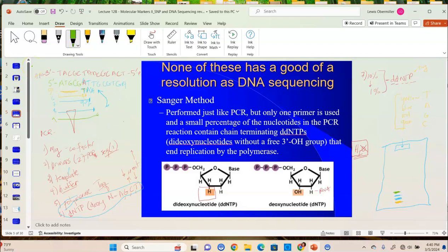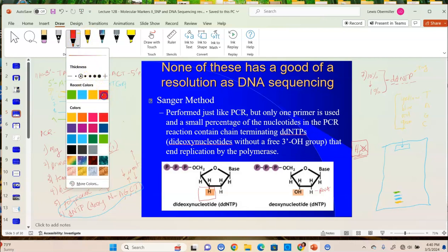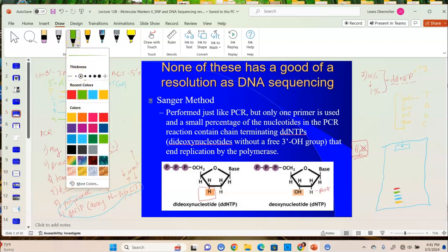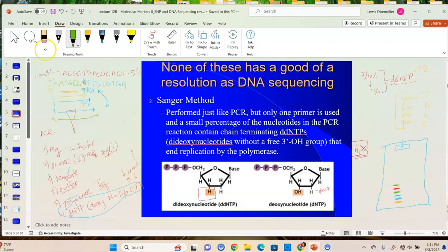And then the next one after that, so we have C is green, it would be G, which is going to be red. So that would be red. Right. And we just keep going till we get to the end of the thing. So I'll just keep doing this. So this one is a C. This one's a G, so that's red. Again, we have another C, so that we made C's green. So we'll have a green band. And then the next one, G, C, G is going to be red, right? So the next one would be red.